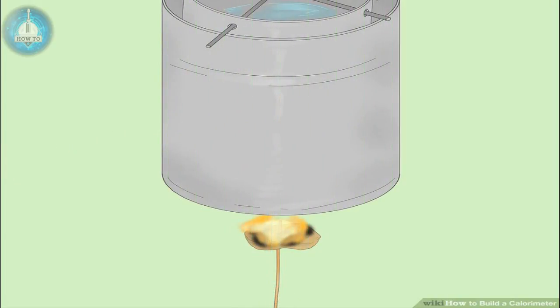Let the food burn. Keep the cans over the food for as long as it takes to burn completely. As the food burns, it will heat the water in the small can that is suspending in the large can. Carefully watch the food as it burns. If it goes out quickly, before the food burns completely, relight it.